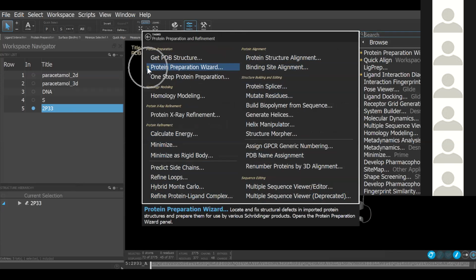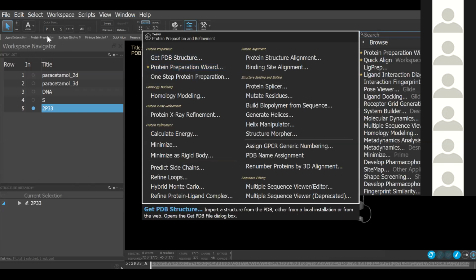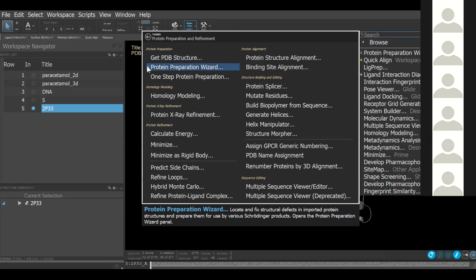If it is activated, then you have this particular tool available over here. If it is not activated, like if I turn this off, then you see that it becomes invisible from here. Now, if you want to introduce it again, I'll just click on the star button here, and you can see that it again got introduced to the panel here.